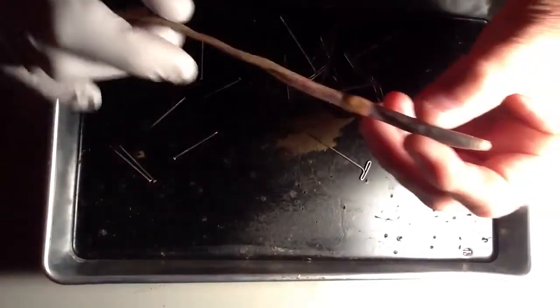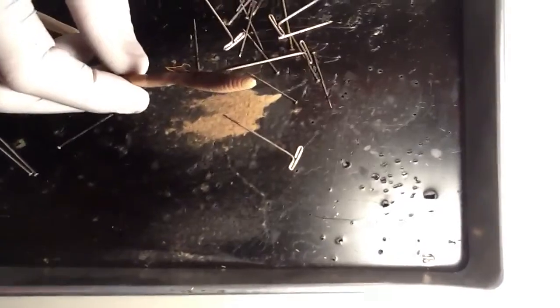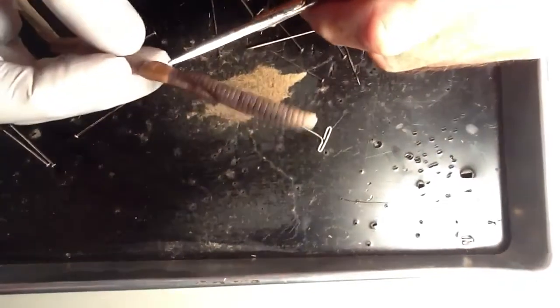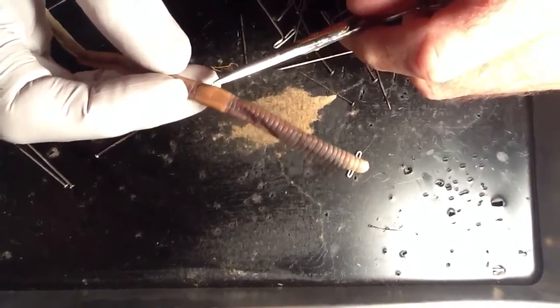We have the worm, and we have the head end here, all right? That's the mouth. We have the clitellum, which is the fat part right here.